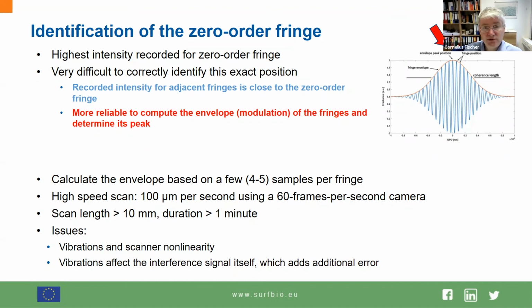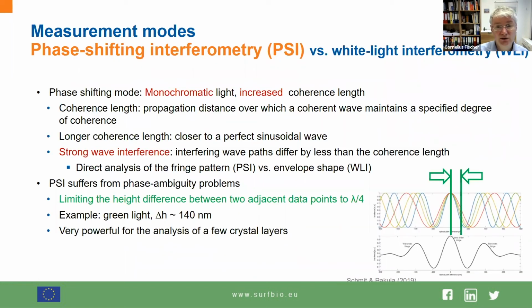And you can really pump this up. You can have a scan length of up to several millimeters, and it still is a time frame that is quite okay. Of course, what has to be done, you have to take care of the environment, and you need a specific optical table where you put your instrument, where you provide conditions that sustain this kind of high precision in the nanometer range.